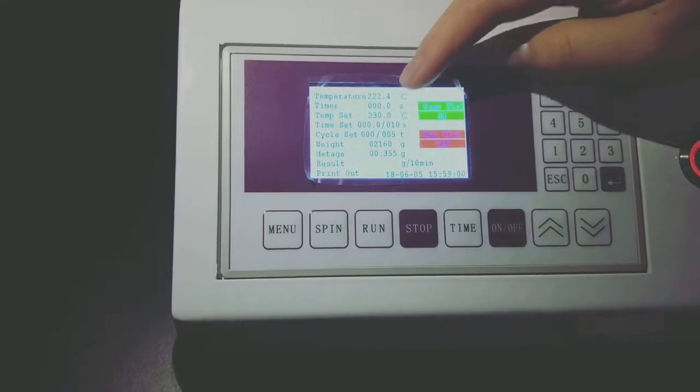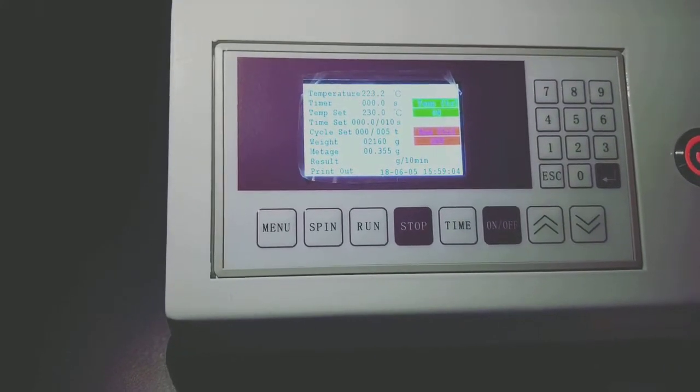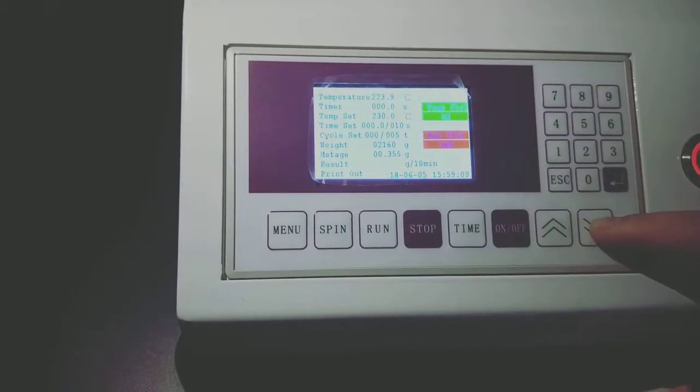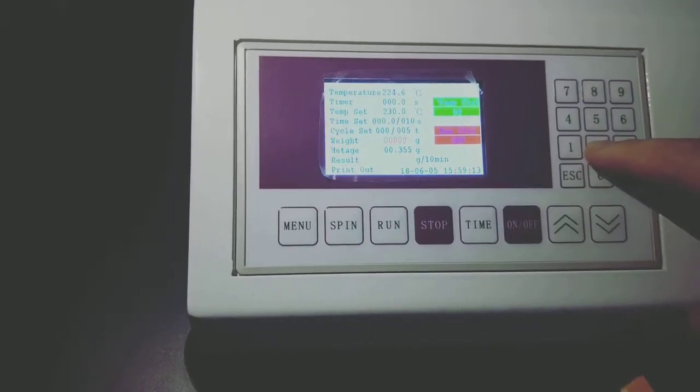And this is the cutting time set. It means we can cut five pieces of extrusion sample. And the weight is 2160.